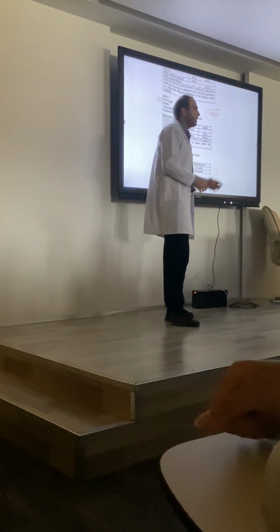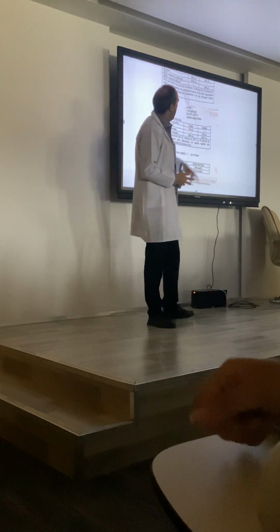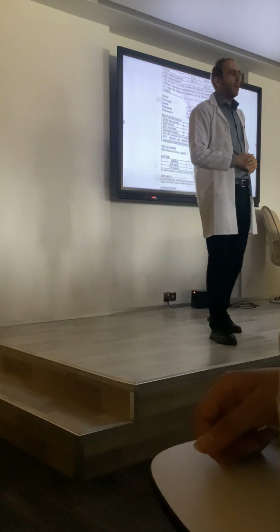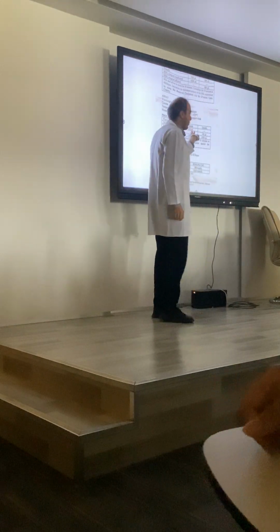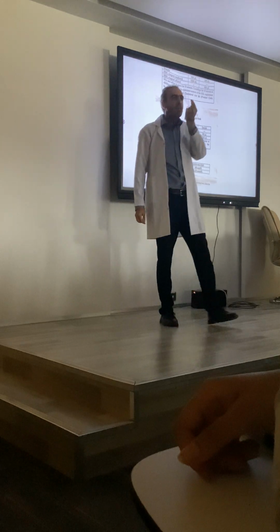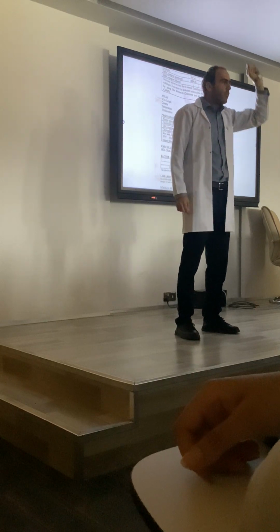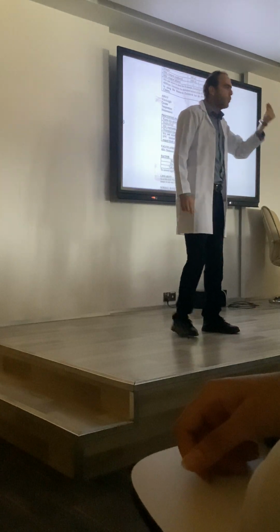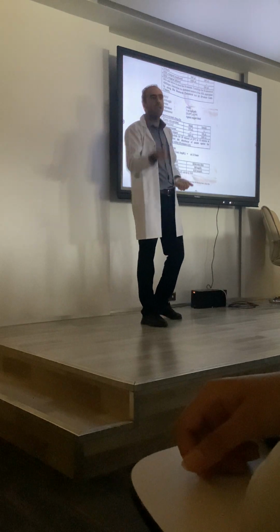So after 20 minutes at room temperature, you will go to the spectrophotometer and read the absorbance at 546 nanometer. You will measure the absorbance of blank and the absorbance of the sample. The delta A here means the absorbance of sample minus blank. But if my colleague set the machine by blank on 0, you have just the OD of the sample. Instead of delta A, you have an A, absorbance.